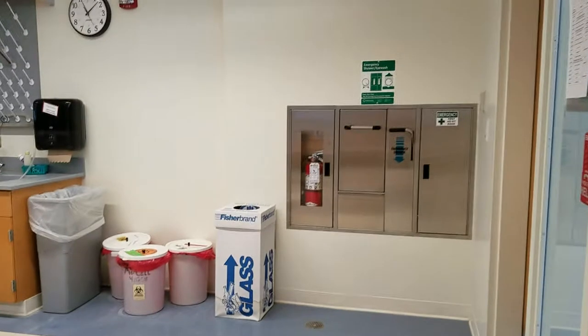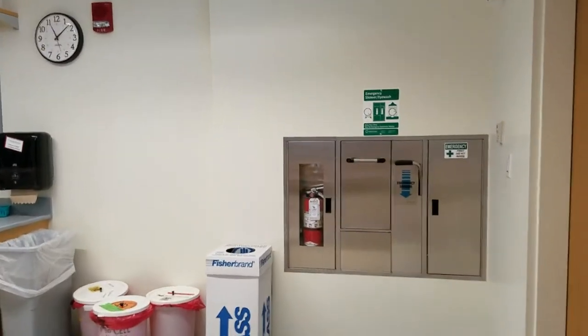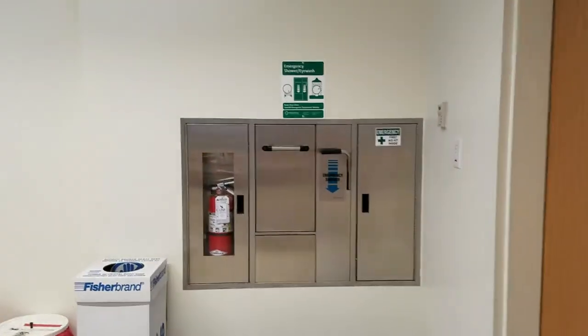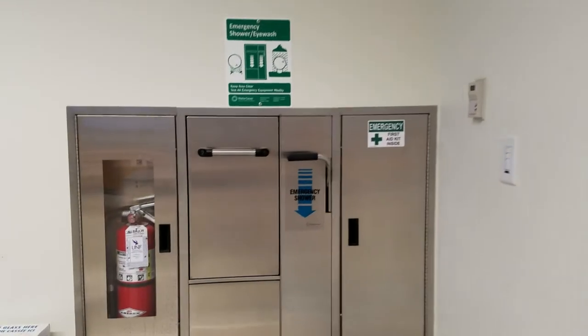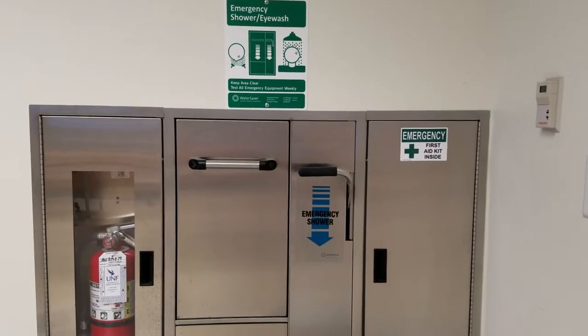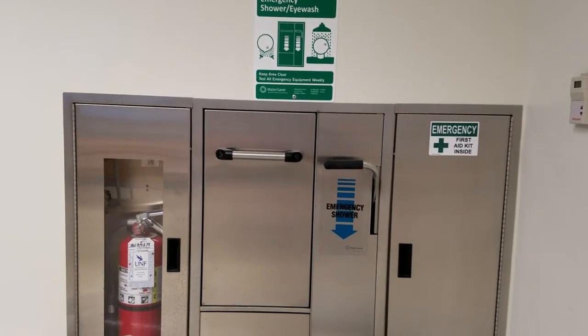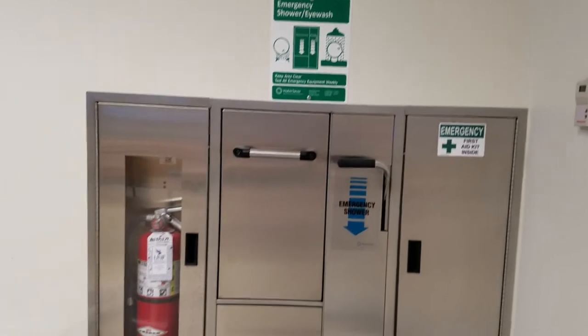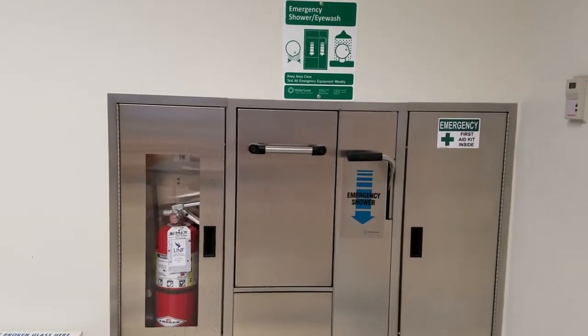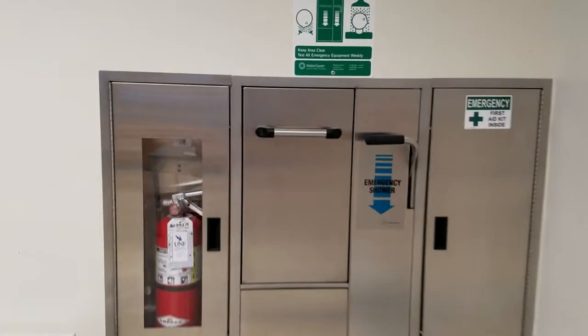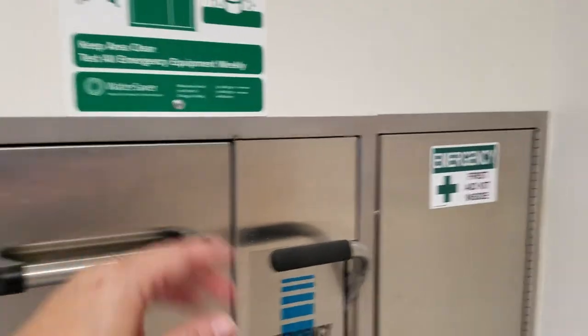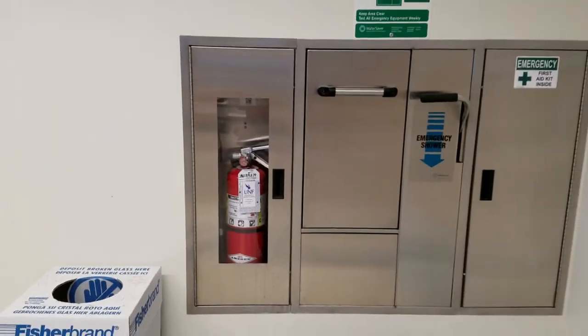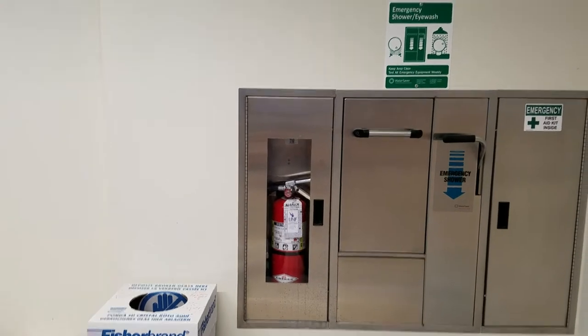When you enter the room, the first thing to your right is all the safety stuff. So we have our emergency safety kit, the first aid kit, we have the emergency shower controller as well as the eyewash that's behind this panel. We also have our fire extinguisher.